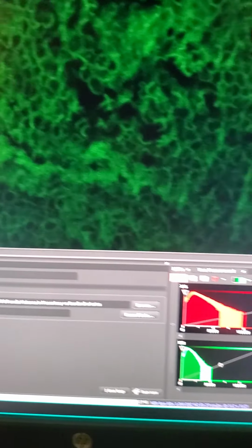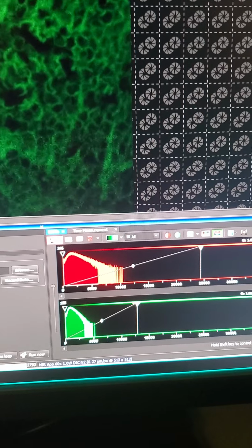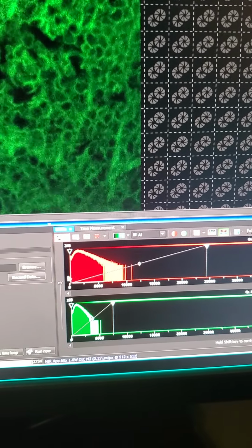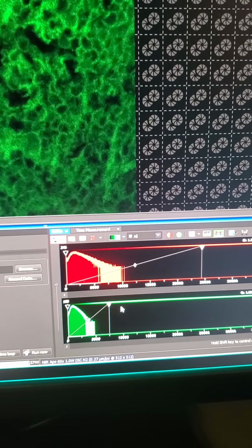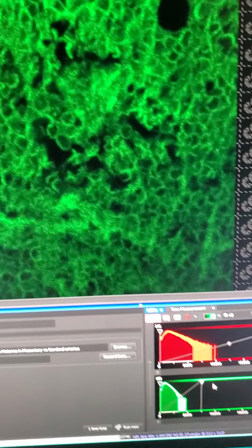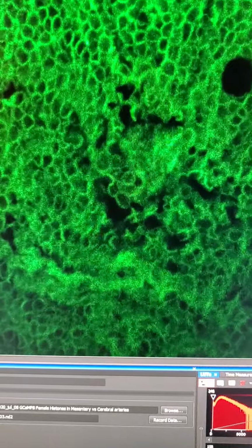If I look up at my image, it may appear somewhat more dim. So again, I may make some adjustments to how my display is being done. So here are my levels in the LUT space, and I'm just changing what levels are being displayed and how with my linear scale. Now this is going to be a grainy image because we're going very, very fast.